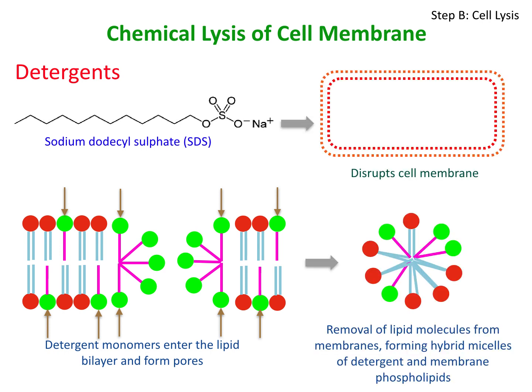Now, in the case of animals, since the cell wall is not present, treatment with detergent alone is enough to bring about cell lysis. Thus, EDTA is not required for lysis of animal cells. However, please take note, EDTA is used here not for lysing animal cells but for inhibiting the activity of DNases.